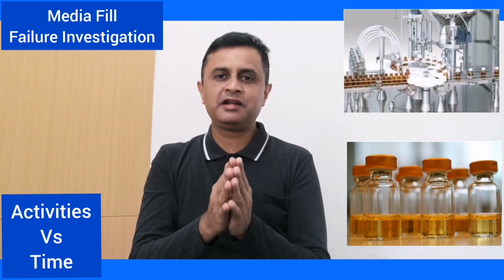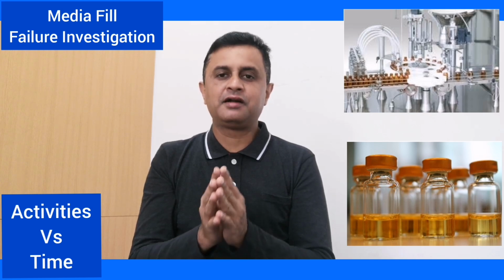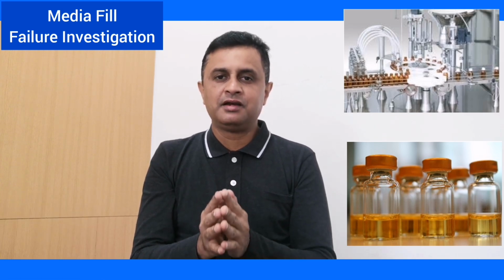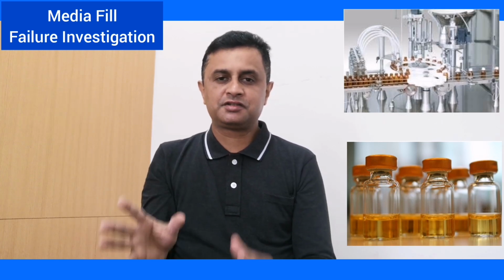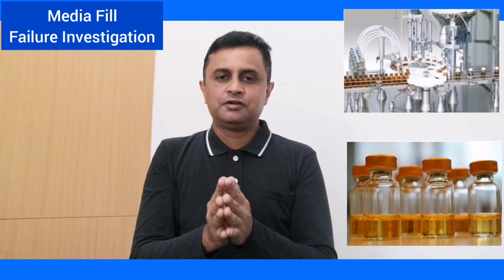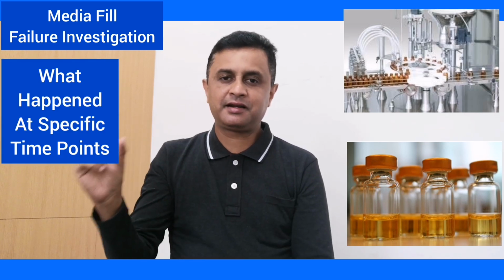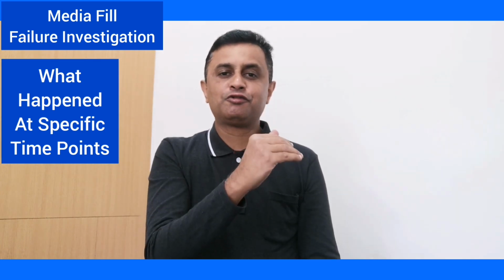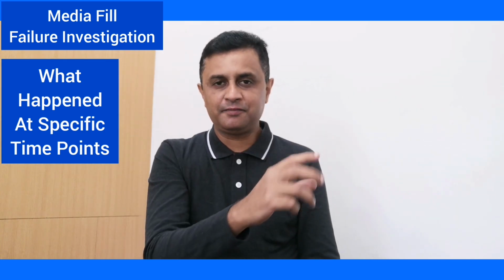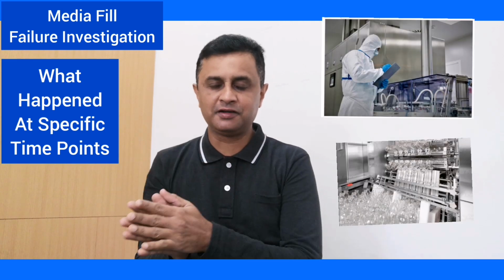Now we have to correlate it with the contamination failures. For example, we have 100 trays of media fill, and out of 100 we have failures in the 10th, 15th, maybe 38th and 46th tray. To understand what happened during those exact trays, we have to see when those trays were filled and what the activity was. That is the simplest way to correlate activity against the failure.